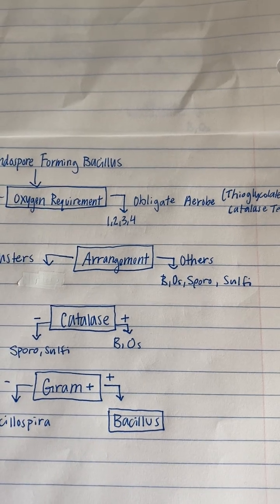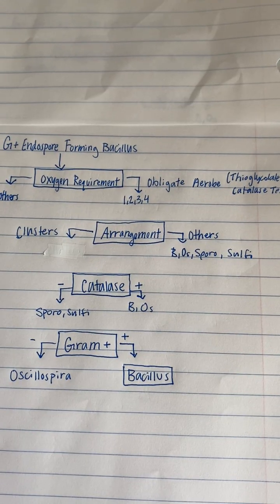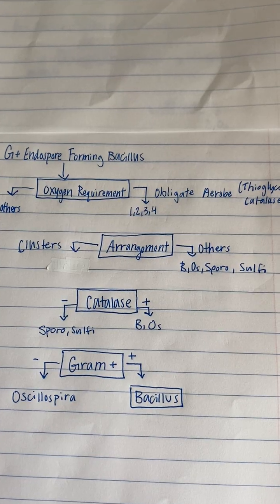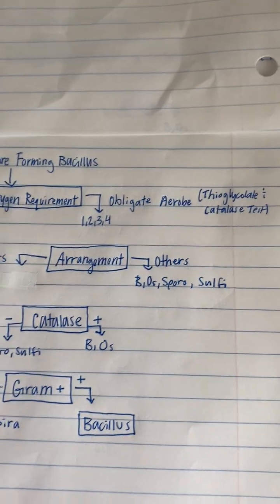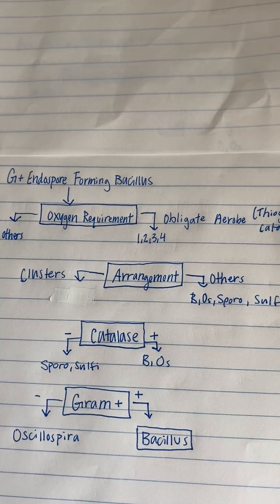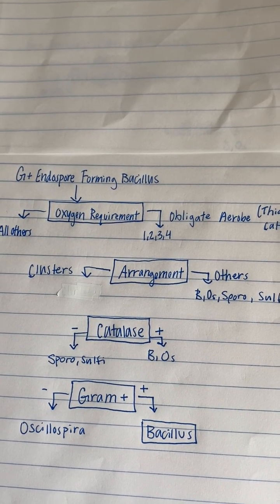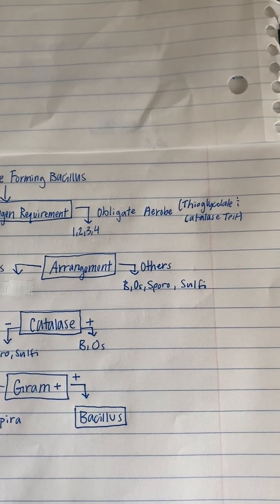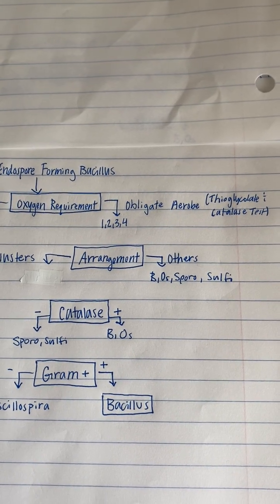There's also the TSI agar test, but my results were flawed. I got the result K/A, which would mean that the microbes can grow anaerobically, but this is not true if these others indicate an obligate aerobe. I had a classmate that also tested the same isolate, and she got the result that they grow aerobically, so I'm assuming my test was just wrong, and in the future it would be best to redo that test.